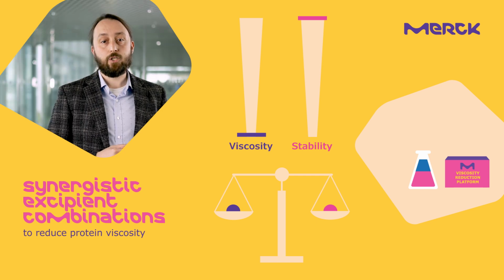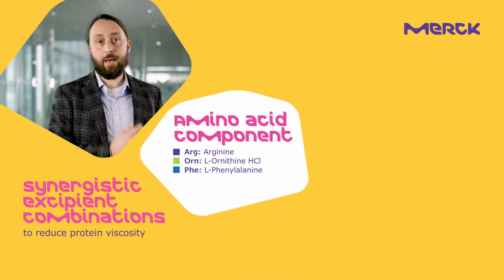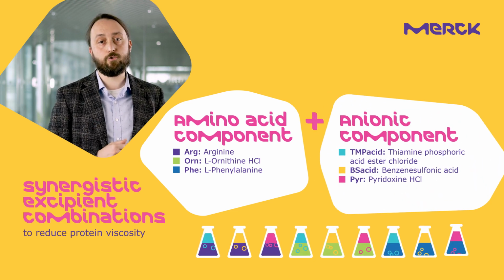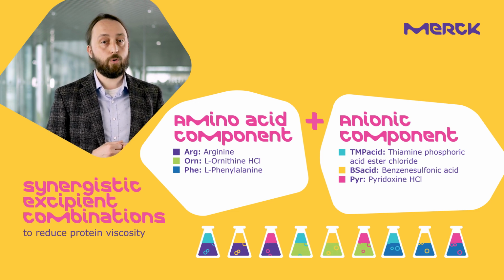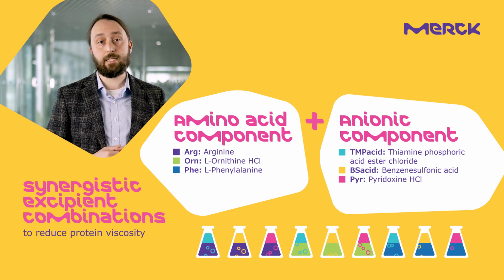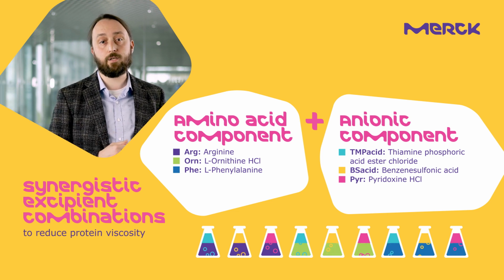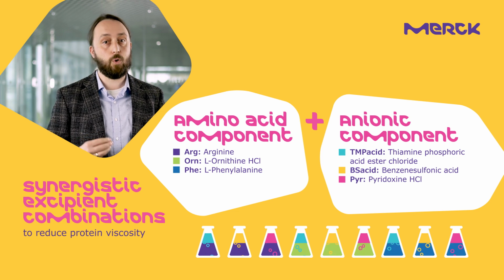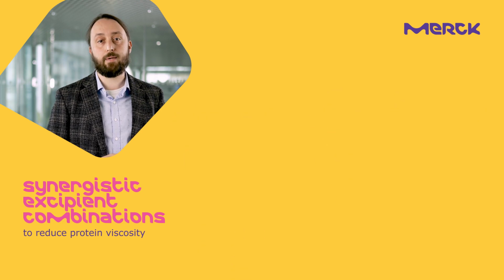We typically combine two different functional groups of excipients, amino acids on the one hand and anionic excipients on the other hand, a total of 9 functional combinations. When combining an amino acid, which typically not only reduces viscosity but also has a stabilizing effect on proteins, with an anionic excipient, which has a much stronger viscosity reducing effect but also a higher risk of destabilizing the antibody, we create a synergy in a sense that a lower viscosity can be reached because both excipients work better together than alone, and at the same time stability of the antibody can be maintained.